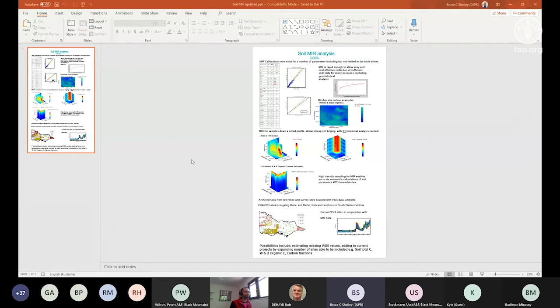And again, as pointed out earlier, the issue with that is the attributes that you're measuring in the spectra are a long way from the actual component that we're interested in. The only thing to point out there, I guess, is we've had a bit of a crack using support vector machine as well against the traditional PLS.